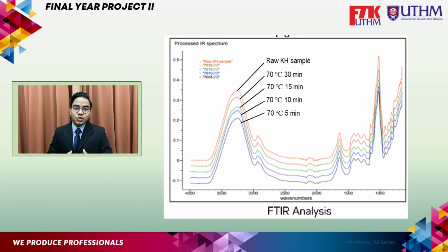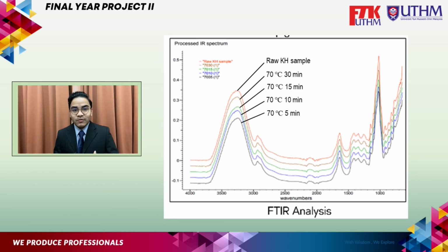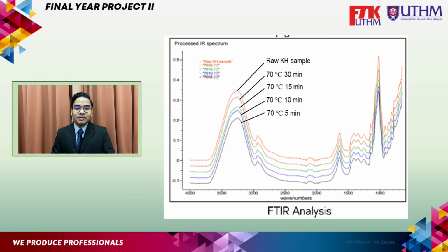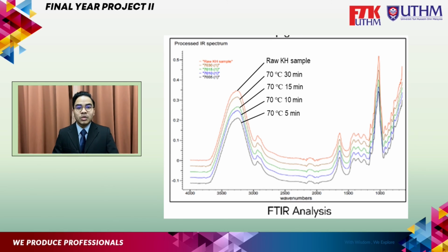FTIR spectroscopy is a method used to identify chemical structures present in any foods or substances. Honey can be identified for its structure, especially its phenolic characterization, with the help of the IR spectrum being measured. The phenolic compound was said to be present in the carboxyl group, which is within the range of 3000 to 3300 per centimeter. The phenol was also said to be within the region of hydroxyl, as it is attached to the benzene ring structure of the phenolic compound. A previous study has also shown similar results for identification of phenolic compounds in honey.